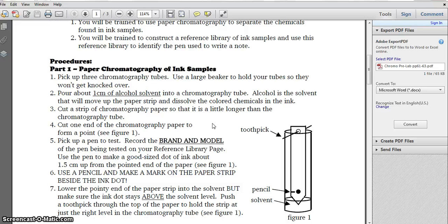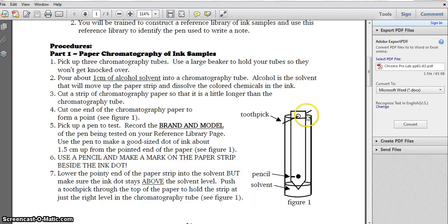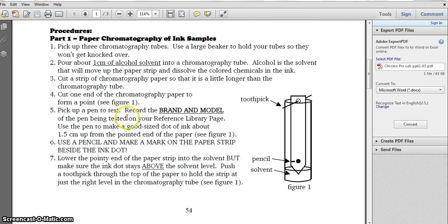Here's the procedure. We are not using the toothpick style. It works better if we just turn the edge of the paper over at the edge of our beaker, and that's what we'll be doing. So you don't have to rewrite every word of this procedure. You can make it in shorthand, but when I see it, it needs to represent well the procedure, and you should be able to work from your lab notebook as easily as from here.